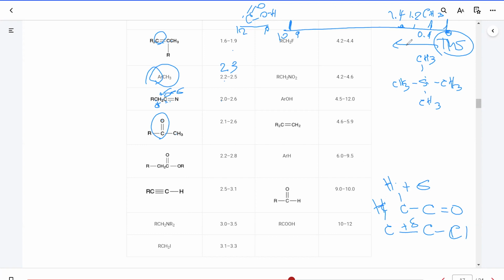And that's what I usually start with in lecture: how the machine is designed and the basics of it. But in the lab, we are looking for these numbers. The numbers are more important for us. The location of the signal has to do with the type of hydrogen, shielded or de-shielded hydrogen.